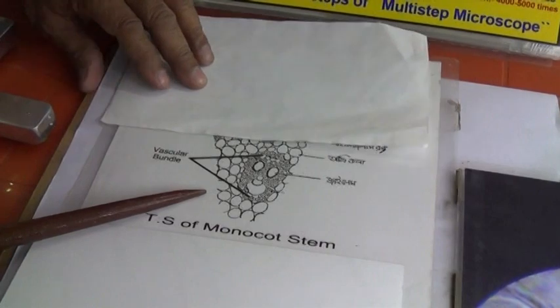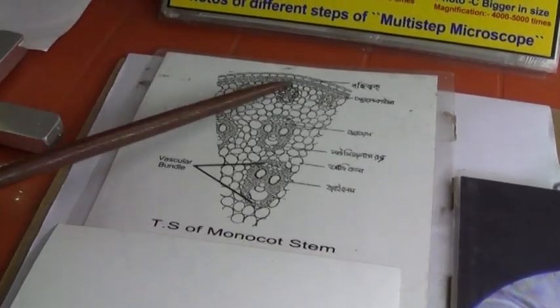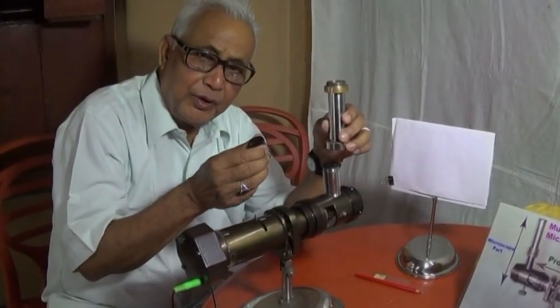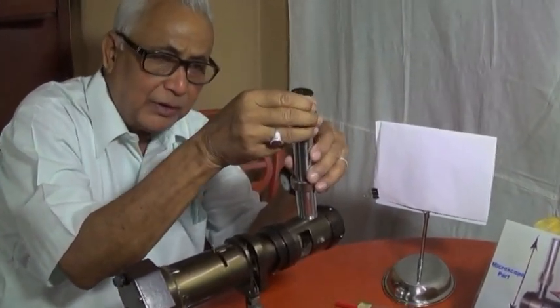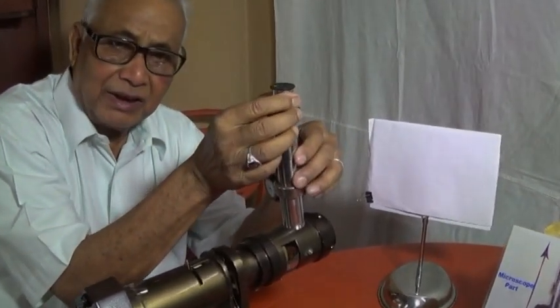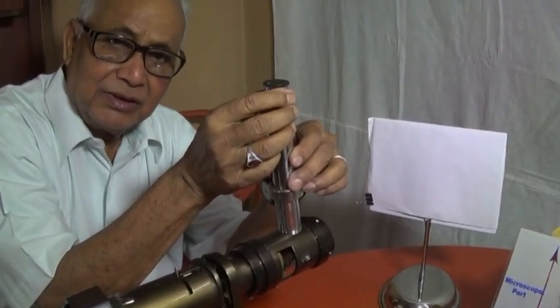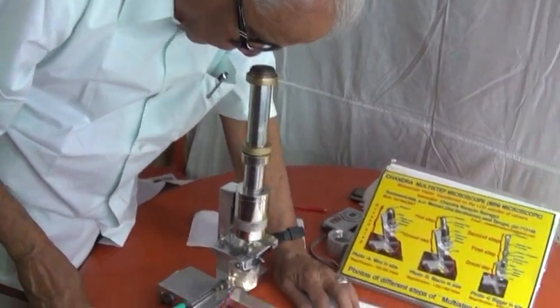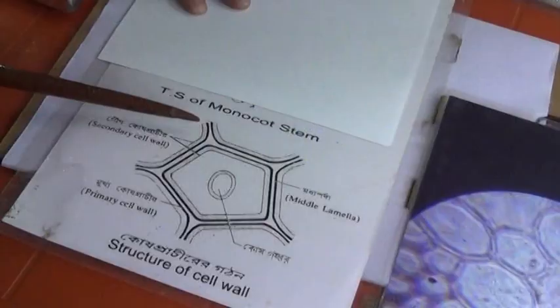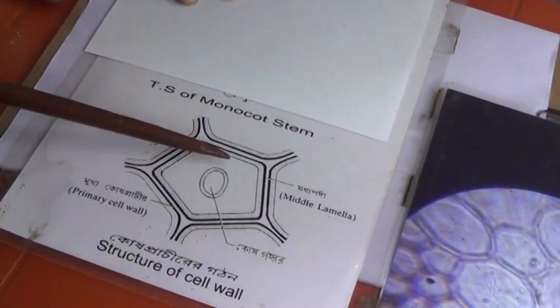If I view through the eyepiece of second step, we can get magnification 5000 times. We are observing the structure of the cell wall which divided into three parts: middle lamella, secondary wall, and primary cell wall.